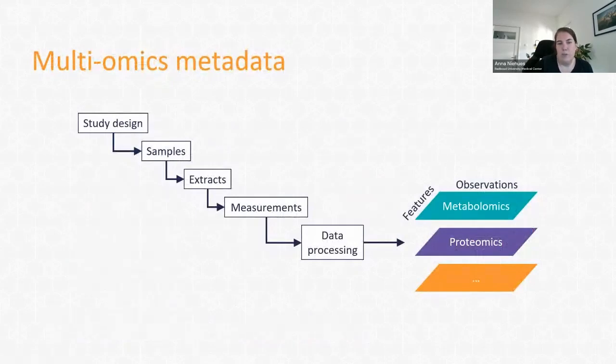So in order to apply these guidelines to multi-omics datasets, we have to consider various aspects ranging from the experimental study design to individual measured molecular entities. For understanding and reusing the data, it is important to capture the complete provenance of the samples and the data. Therefore, in the following, I'd like to give some insight into our process of creating FAIR multi-omics metadata.